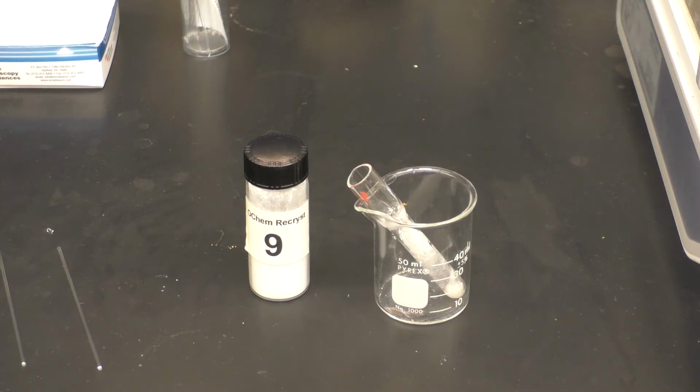We can take the mixed melting point to confirm unequivocally the identity of the unknown compound. If that mixed melting point does not provide a positive confirmation, we can then do additional mixed melting point measurements to help provide the identity of the unknown compound.